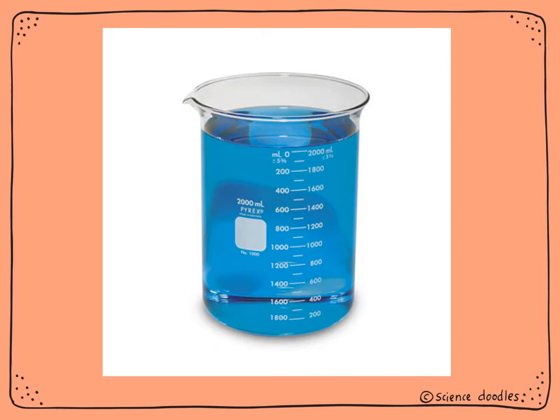Notice it has different markings on the side to measure in milliliters, and you have to look at the lines on the side to figure out how many milliliters you have.